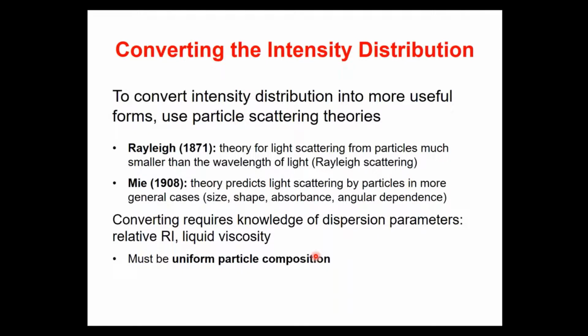That one formulated by Lord Rayleigh, which covers light scattering from particles that are much, much smaller than the wavelength of incident light. Rayleigh scattering is the theory that explains why the sky is blue, for example.